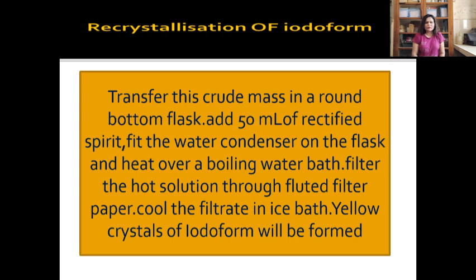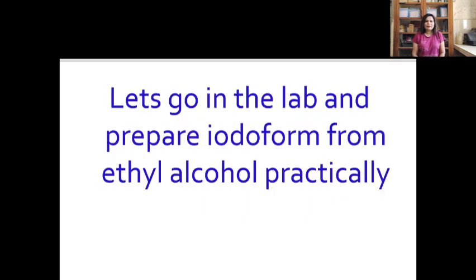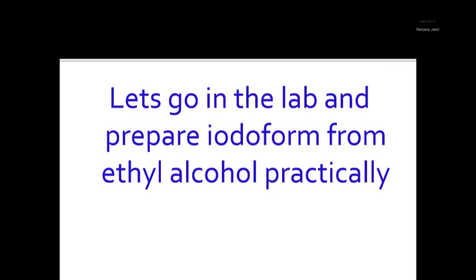We'll get the yellow crystals of iodoform. Filter them out, and we'll dry the yellow crystals of iodoform in the fold of filter paper. In this way, we'll get the iodoform. Now let's go into the lab and perform this practical of preparation of iodoform from ethyl alcohol.